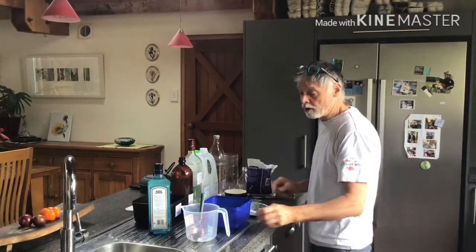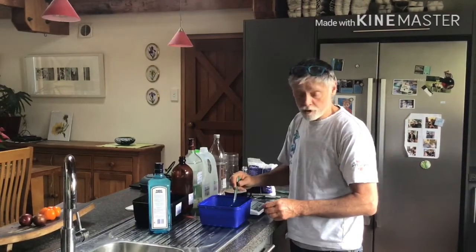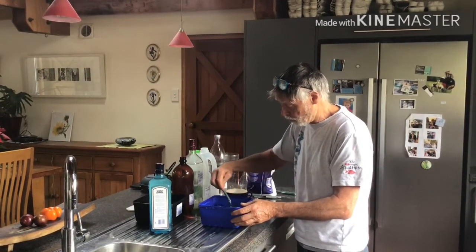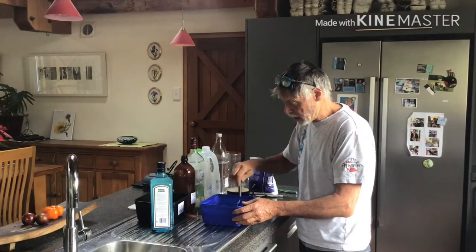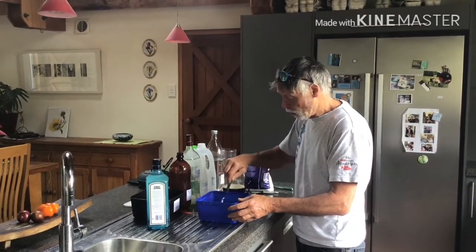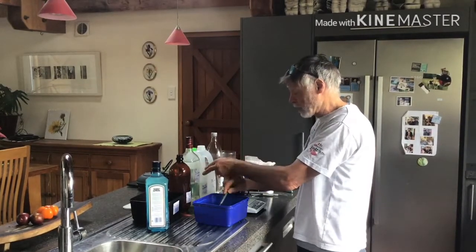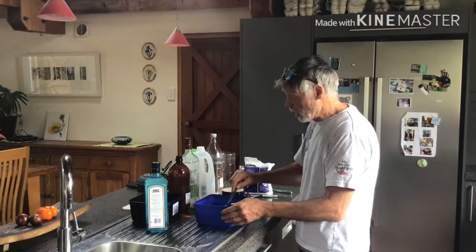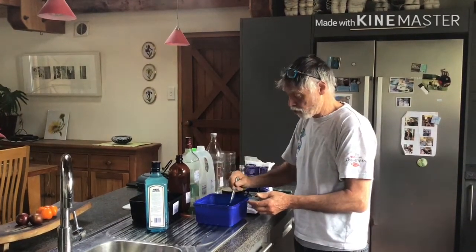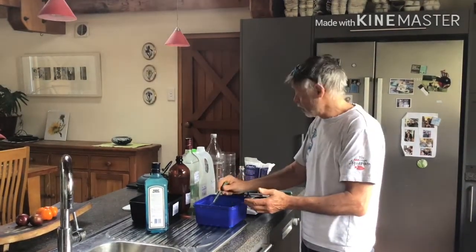You will have found, like me, that making up the 100 parts per thousand solution took a fair bit of mixing, and you might have had to leave it to soak for a while and keep on mixing to get that dissolved. And then, once you've got all your random containers with your 0, 5, 10, 20, 35, 55 and 100, you can just give them a name, make a few names up that are going to suit you. These are our multiple seas in the ocean in the house.